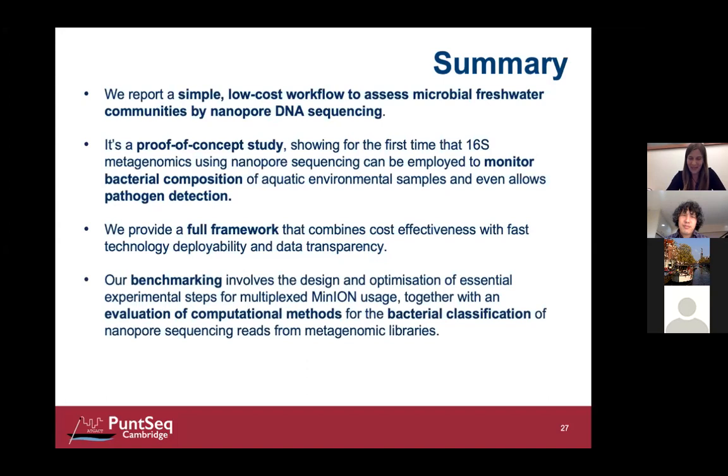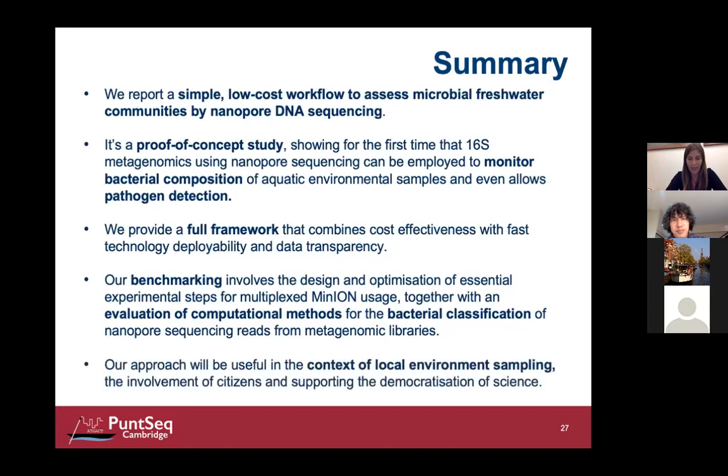And I think our benchmarking especially profited from the evaluation of the different computational classification tools that I showed you. But we in general advise on the complete workflow that you have to take from water sampling to the end bacterial classification and interpretation. And as said, we hope that our study will be useful when it comes to environmental sampling in any sorts of settings, also remote settings.